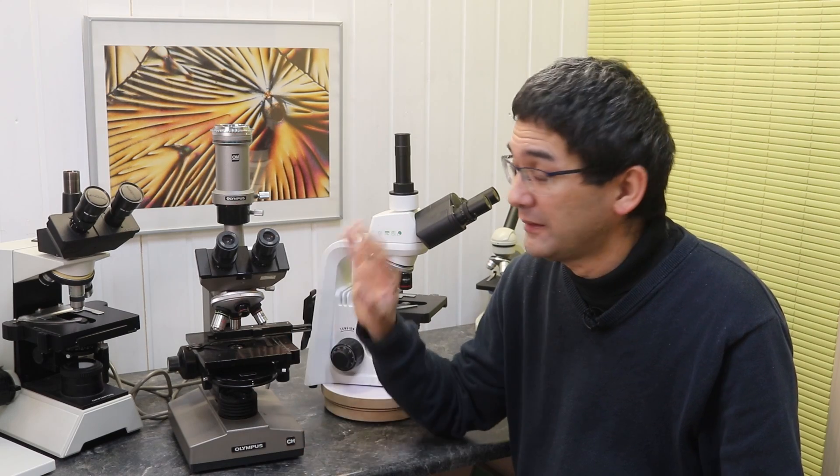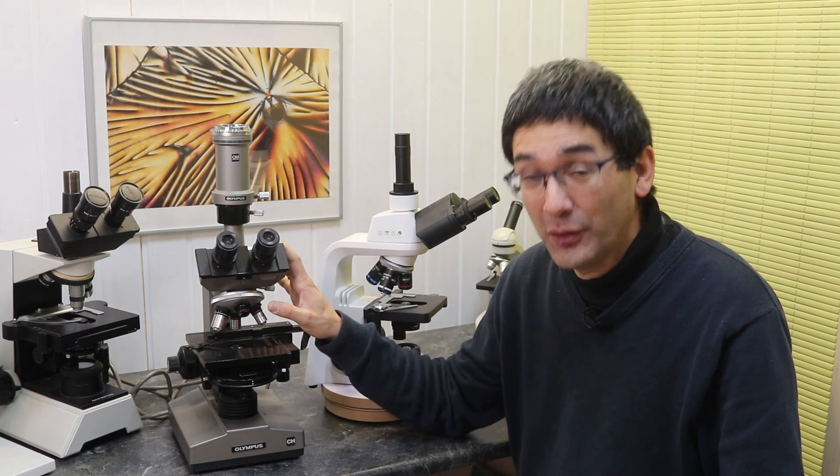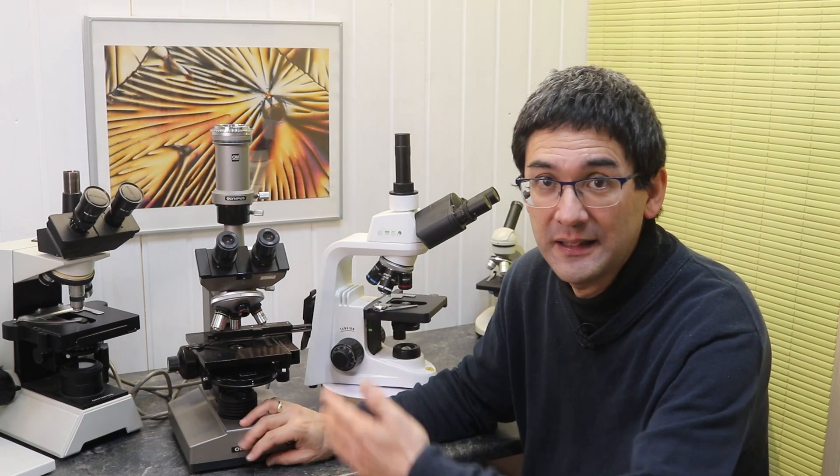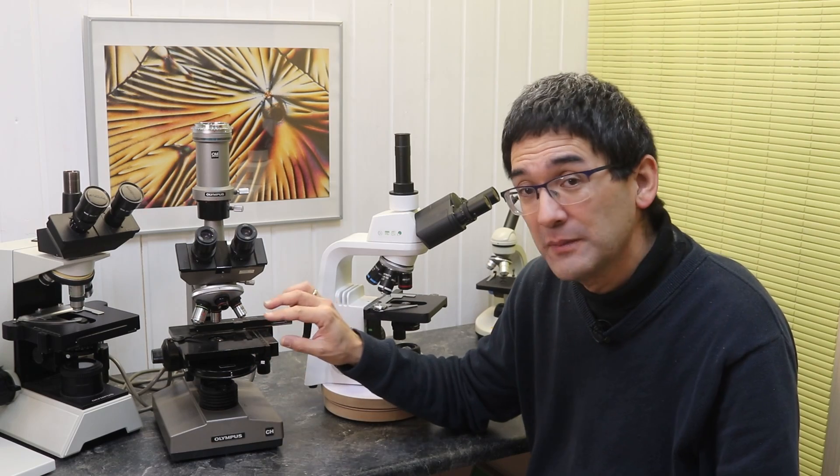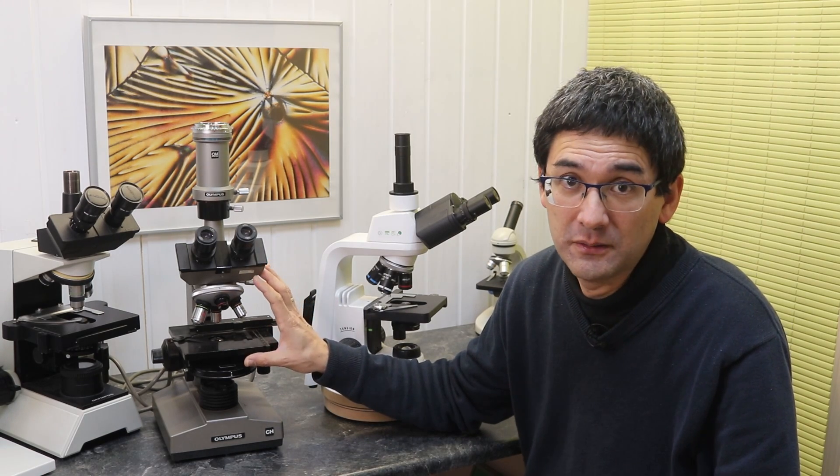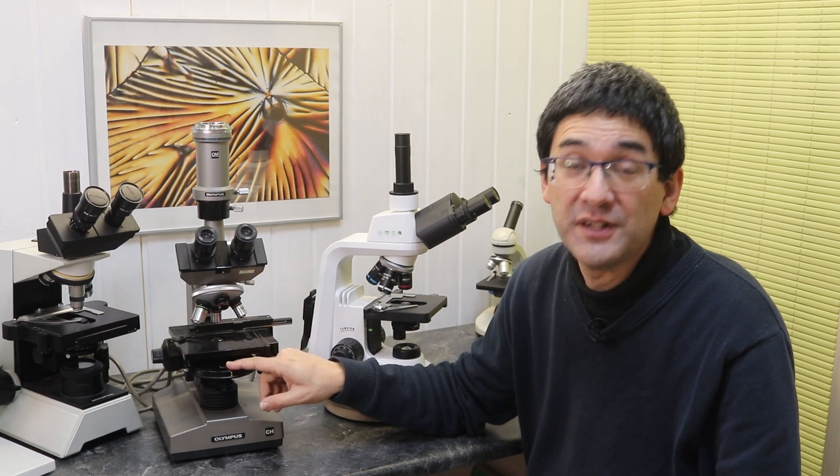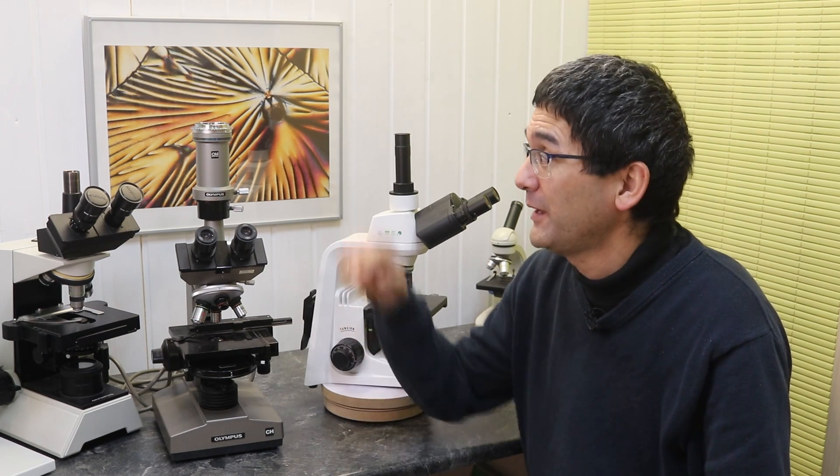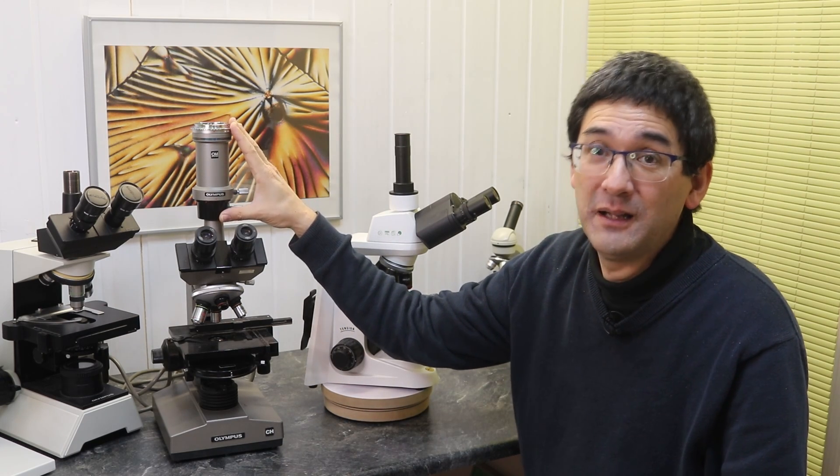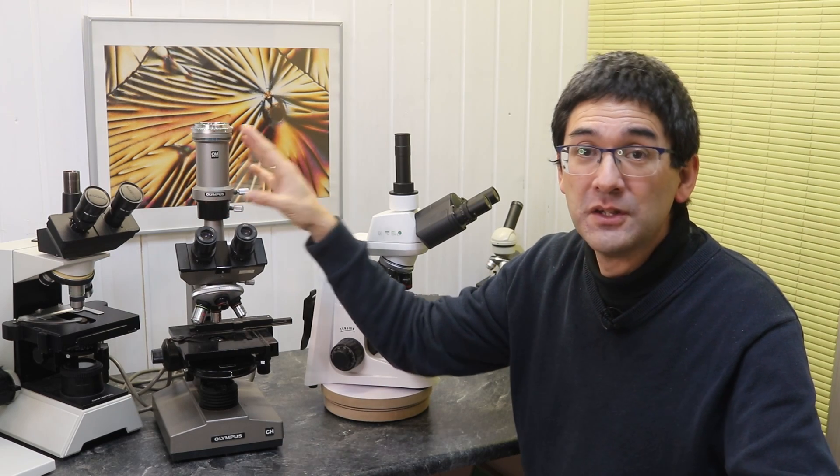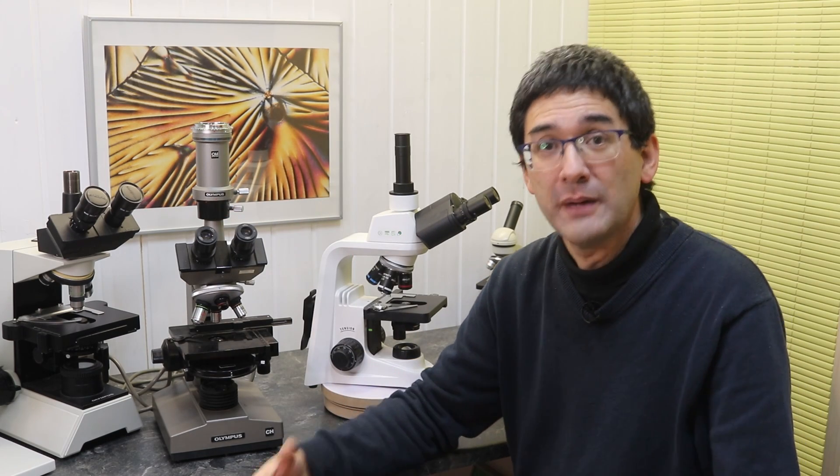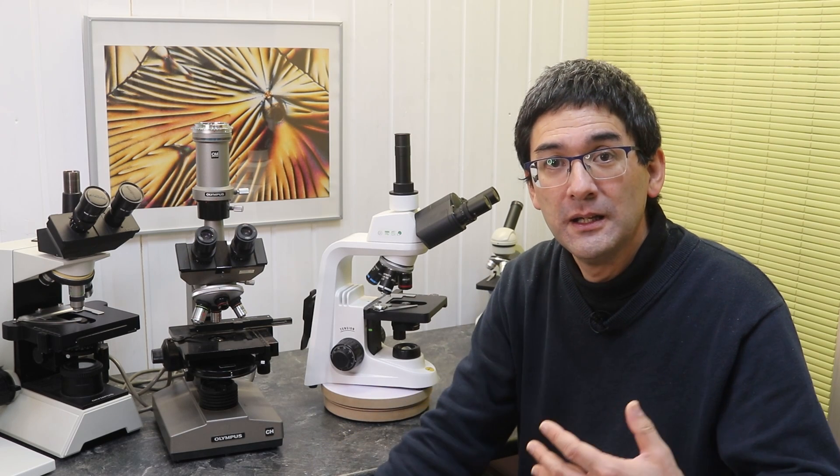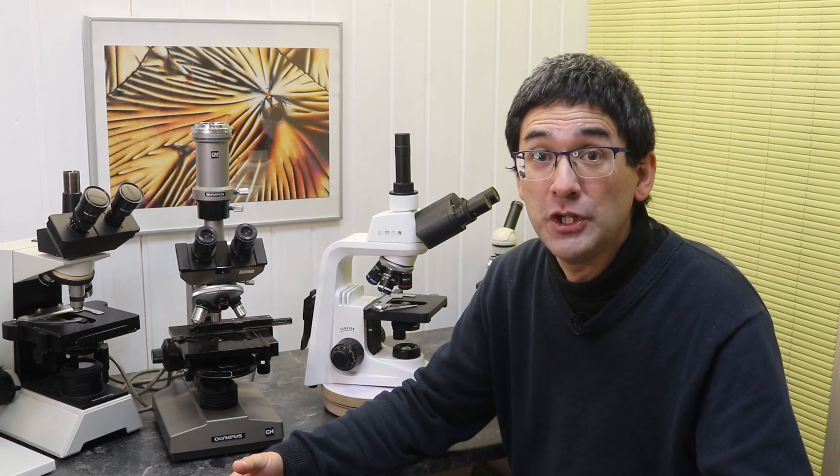For 200 euros you can almost already get a new microscope. So was it worth it? Yes it was worth it because the value now is much higher than that. Not that I want to sell it again, but still. Then I went on eBay, got myself some phase contrast optics, a phase contrast condenser - 300 euros. I got myself this one up here, again costs some money. So you see, just because it's a used microscope does not really mean that it's going to be significantly cheaper.